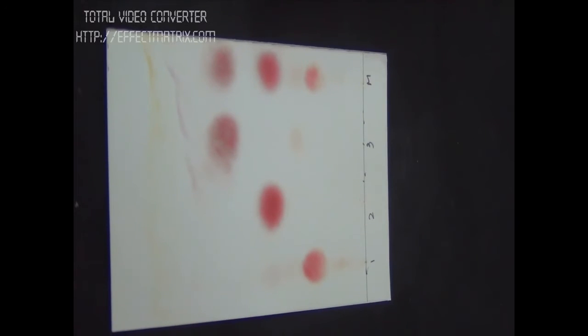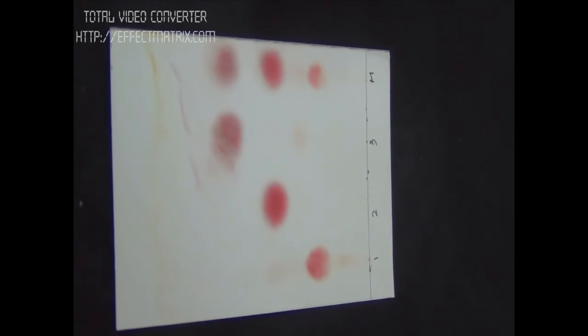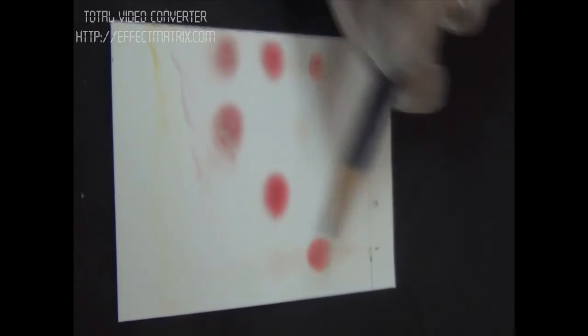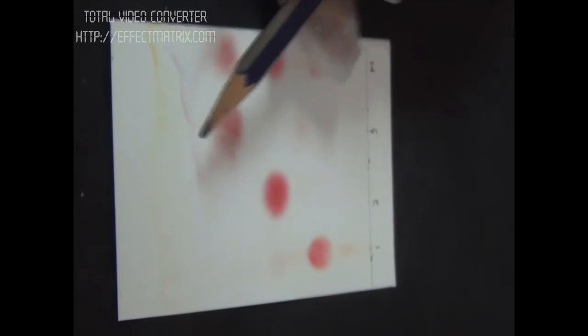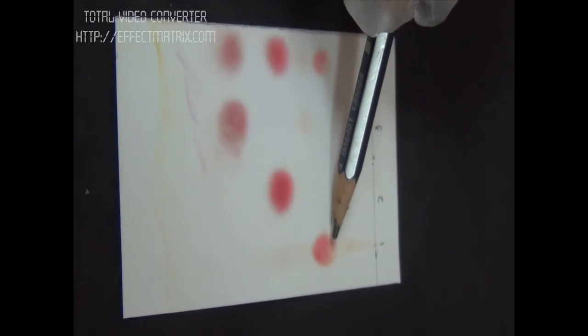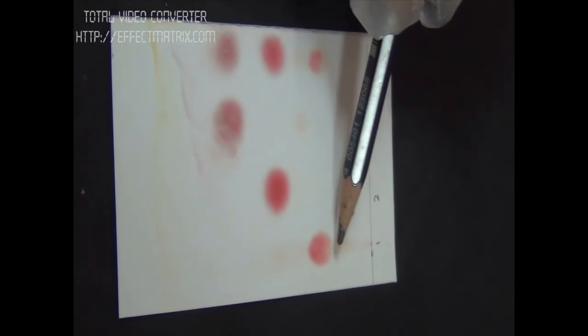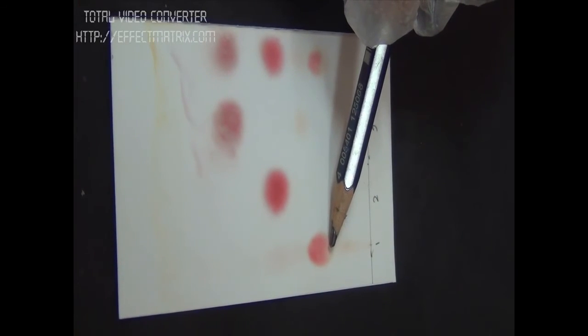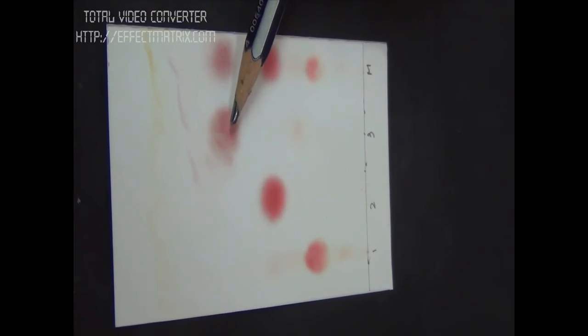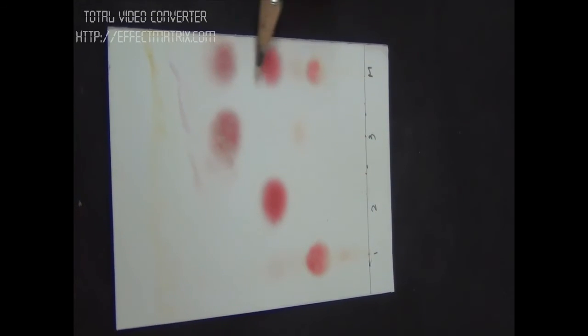Now we will calculate the Rf value. Rf value is the ratio of distance travelled by the spot from the line of origin to distance travelled by the solvent front. We will calculate the Rf value for all the spots we have detected. In the mixture and standards, we have one spot each in samples one, two, and three, and in the mixture we have three spots.